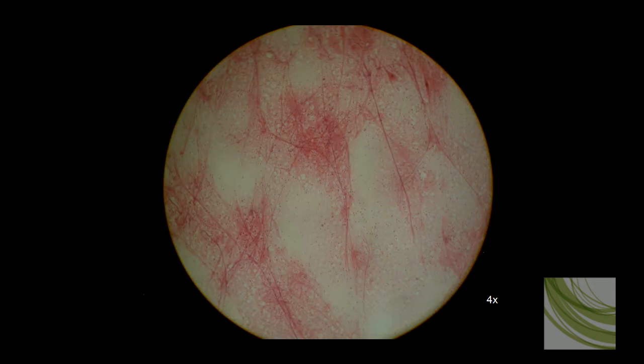Now I shot this part of the slide because we can see a lot of axons through this mess. It's really hard to see any cell bodies. There's big piles of them so figuring out which axon goes to which cell body is a little difficult. Here is a good looking cell body. It looks like there's an axon coming off of it with some dendrites up here.